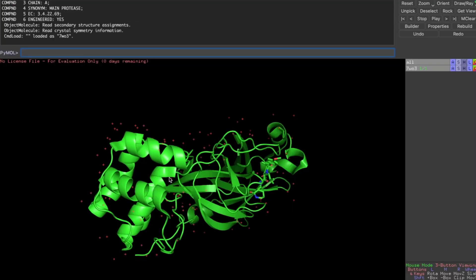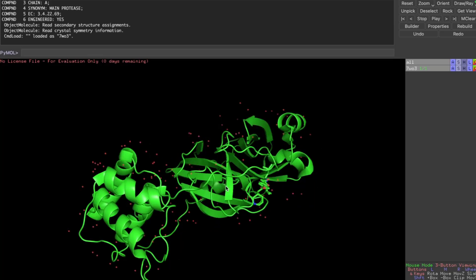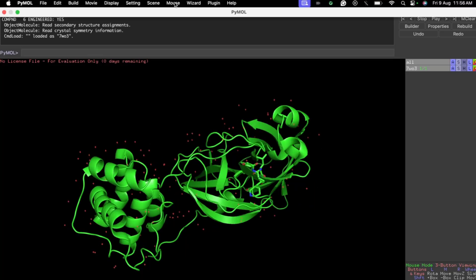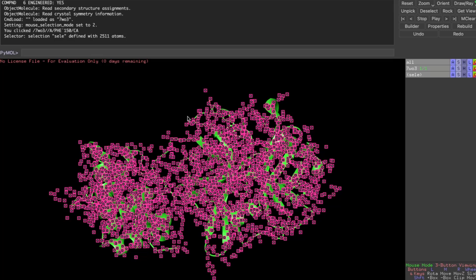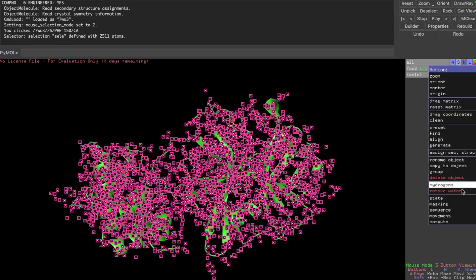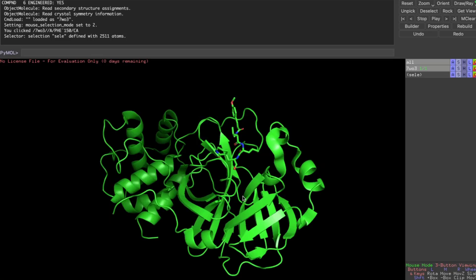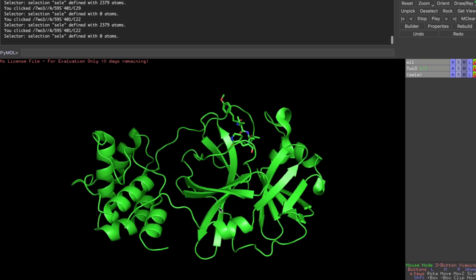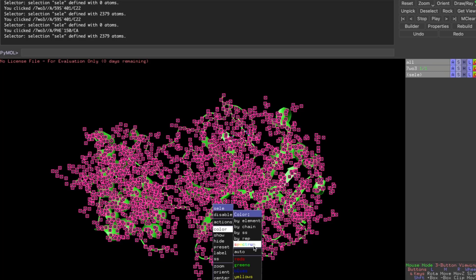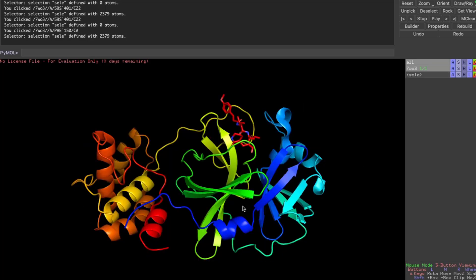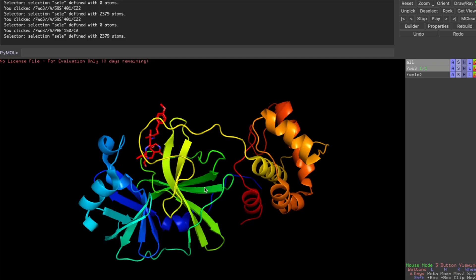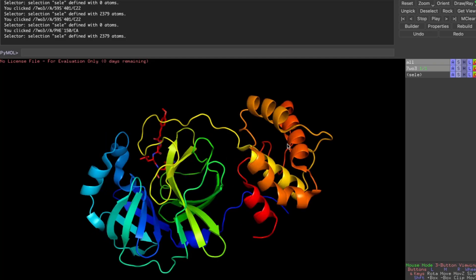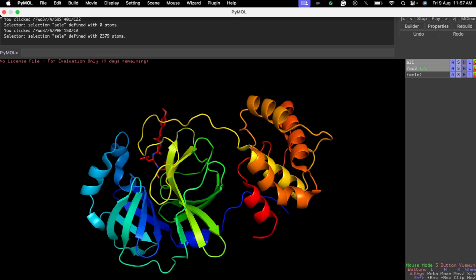Now I can manipulate the structure. I can select a chain, go to Actions, and remove water molecules. You can also remove any ligand, change colors, go to Spectrum and choose Rainbow, or any other color scheme. Bond analysis and other types of analysis can also be performed.